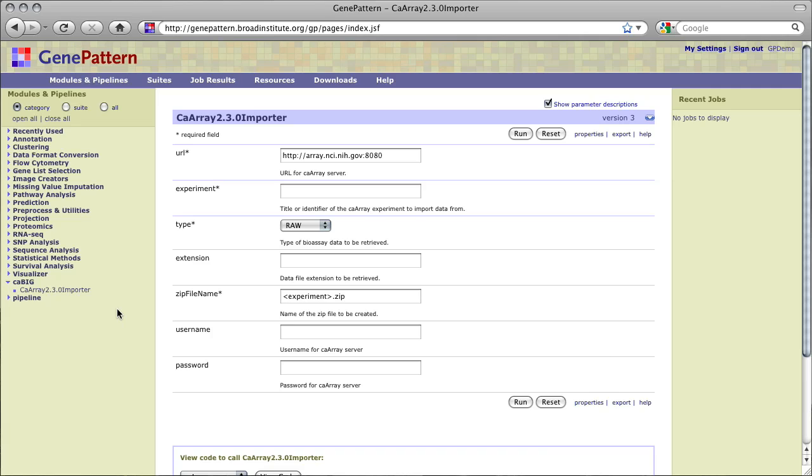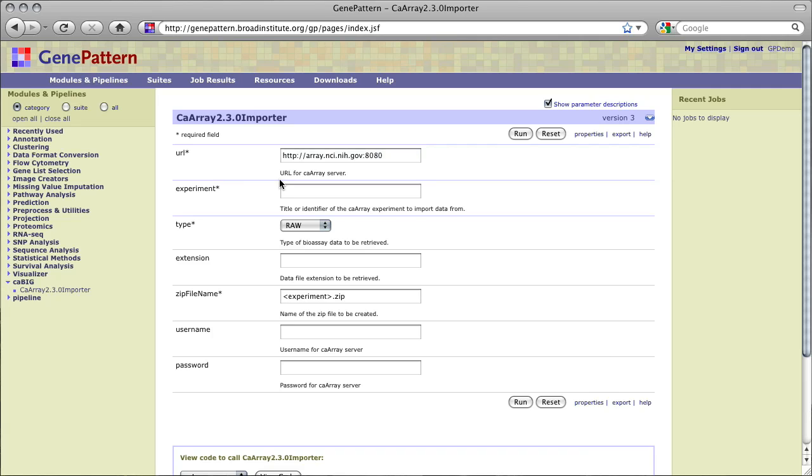To begin, we must provide a URL to a CA Array repository, version 2.3 or newer, from which we are to import data. By default, GenePattern provides the public CA Array instance hosted at the NCI. We could instead provide a URL to any CA Array repository for which we have access. For this tutorial, we will use the public instance provided.